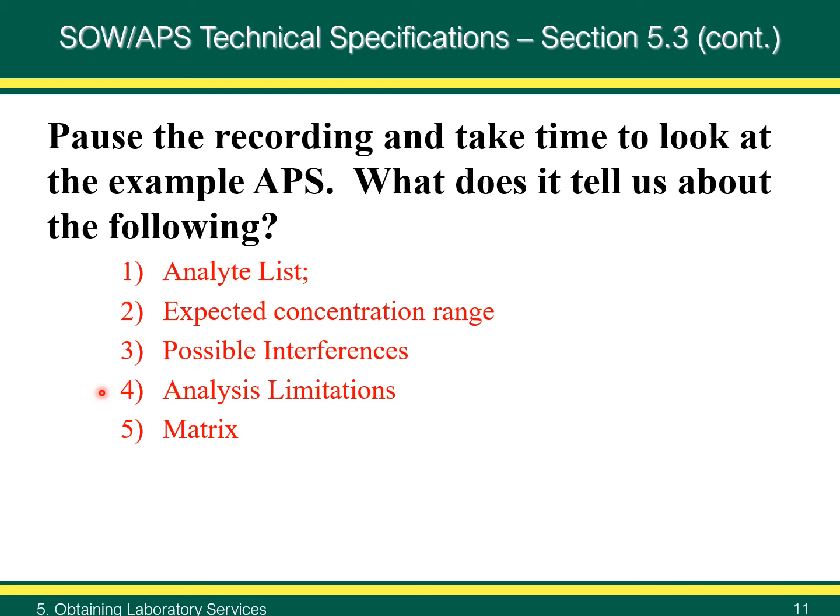Thus, the laboratory may use a direct analysis method, measuring strontium-90, or an inferential determination of strontium-90, for example, measuring its decay product after a known period of equilibrium, once that equilibrium is established. Clearly, preparing the APS requires the technical expertise of a radiochemistry expert.